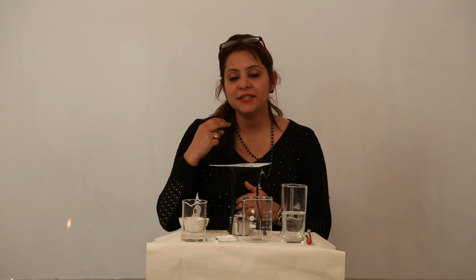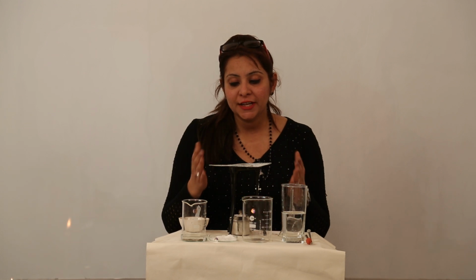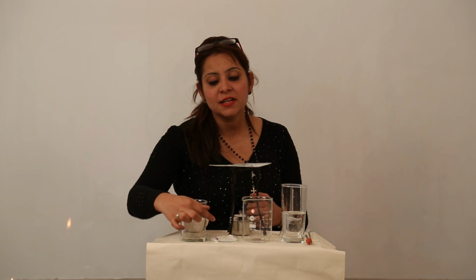Now we are taking up the technique in which we can separate the mixture of two solids by using a suitable solvent. The principle is that one of the components will be soluble in the given solvent, and the other won't be soluble. With this, for your demonstration, I have taken an example of a mixture of sand and salt.